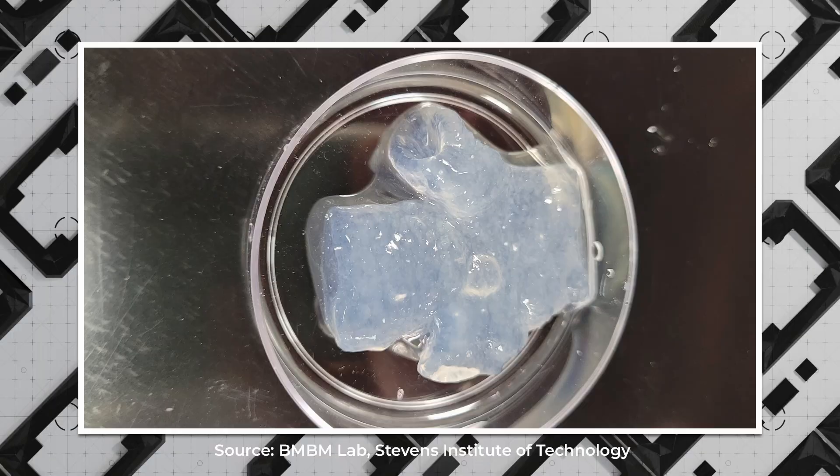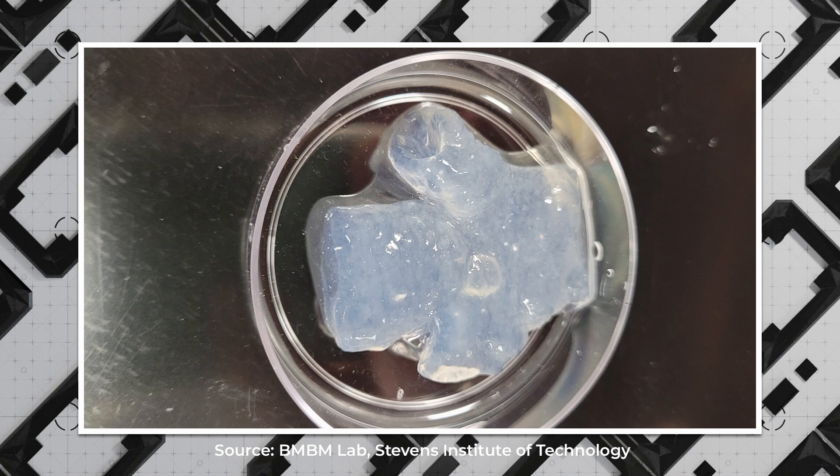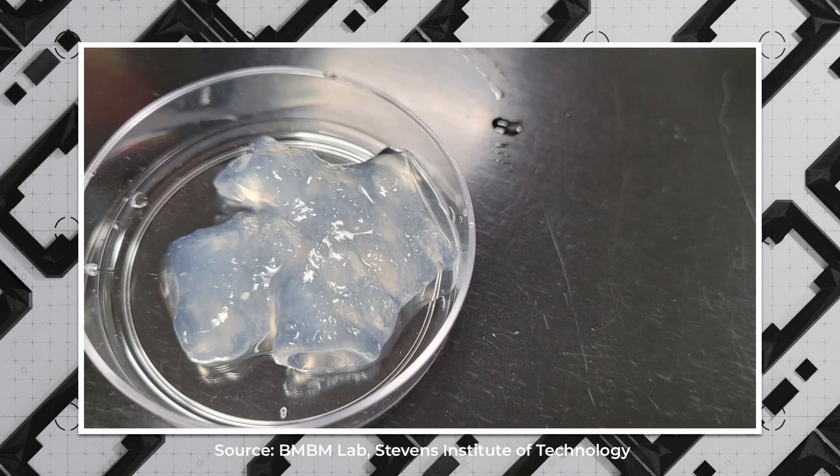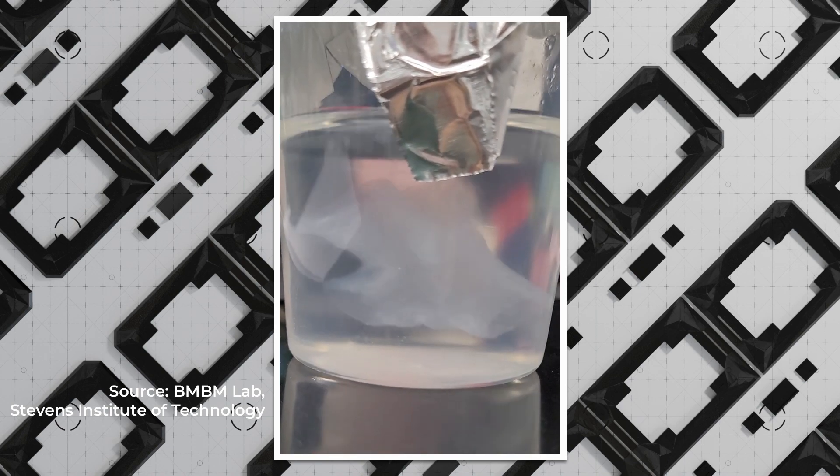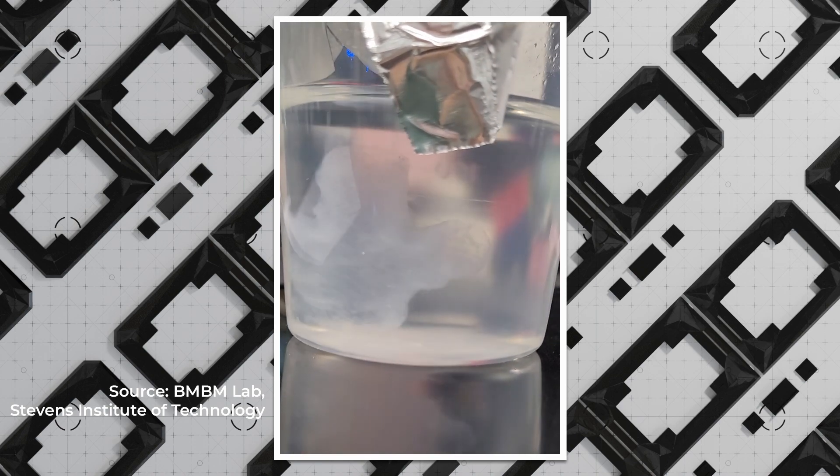So one interesting application that we have, we work on placenta diseases. We get placental cells from the hospital, we print them here and we study them in the lab, and we image them and we see over time how the cells are interacting.